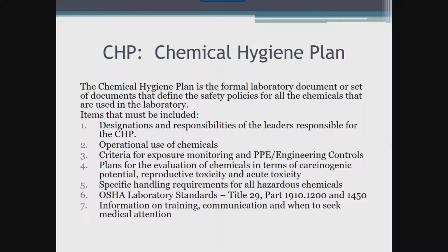The goal of the chemical hygiene plan is to make sure that we have a detailed plan in place to ensure the safety of our staff in regards to every chemical within the laboratory walls. This safety is not only on behalf of the leadership team, but also every employee that works in the lab. So the CHP must include details about how we communicate, train, and educate our staff. This is essentially the quality management plan as it relates to chemicals.